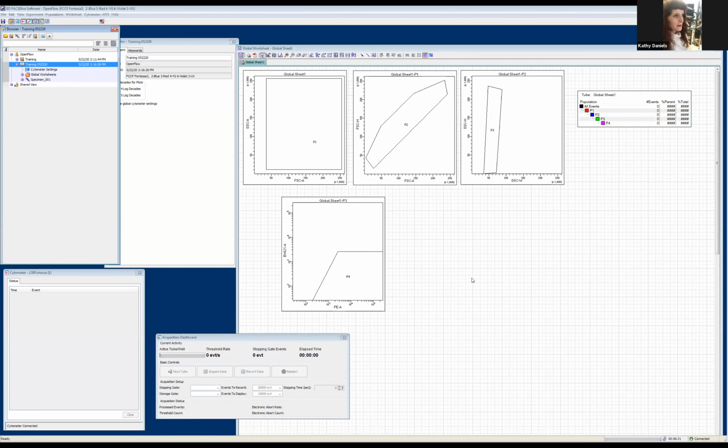So what winds up happening is if it adds an extra decade, typically what winds up happening with the 4 logs is it's showing from a value of 26 to about 262,000 or so. If you select 5 logs, it'll show the first log as that 2.6 to 26. So it's just showing you a little bit more of that negative space. There's a lot more to be discussed about visualization and log and biexponential, and that we can discuss in future sessions. I think we'll talk much more about that when we cover compensation, because it's very useful then to change the scaling.